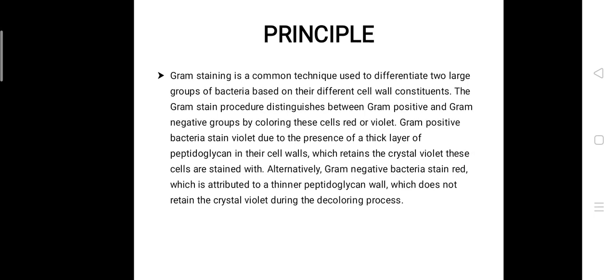The gram negative bacteria appear colorless and the gram positive bacteria remain blue in color. The next is the application of the counter stain, that is safranin. The red dye safranin stains the decolorized gram negative cells red or pink in color, while the gram positive bacteria remain blue in color.